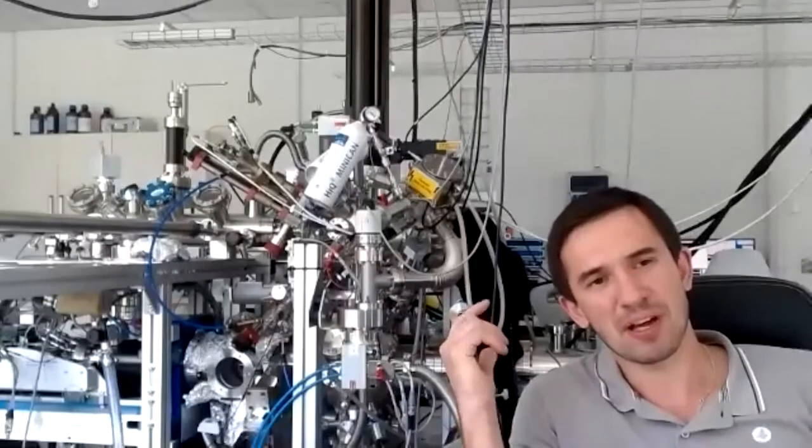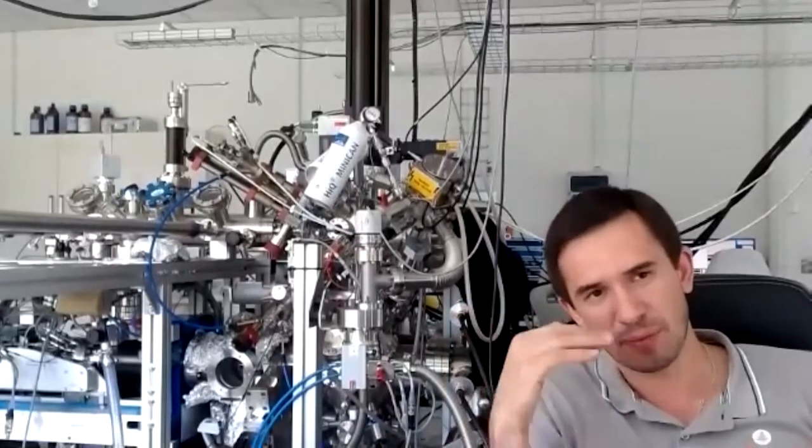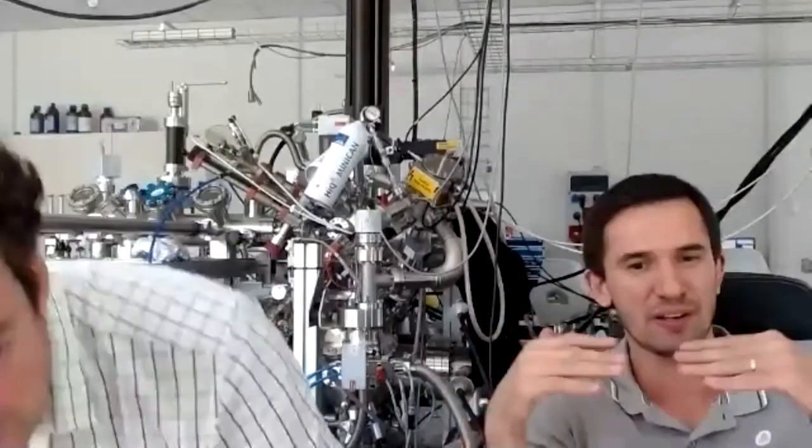Or we can use the same analysis chamber for preparation. So we can prepare a thin film by deposition in the analysis chamber for NAPXPS and the same film for STM, and then we combine the results. However, it is not the same sample.